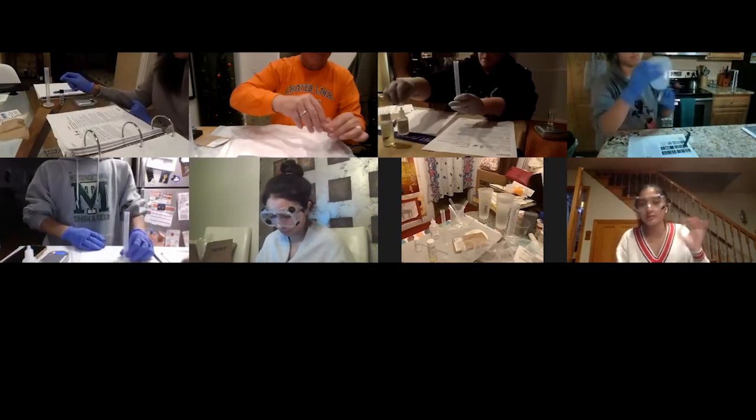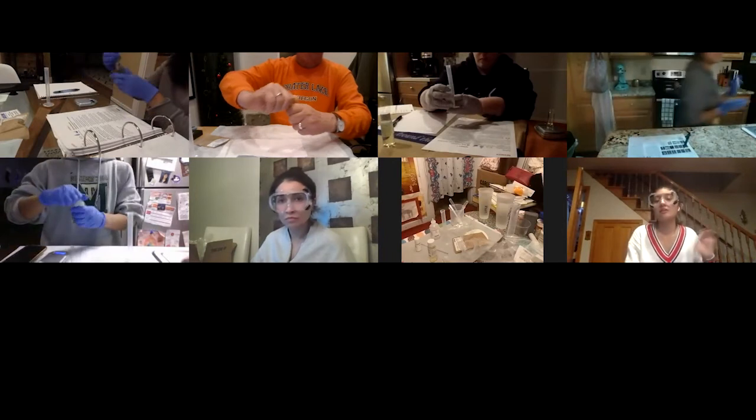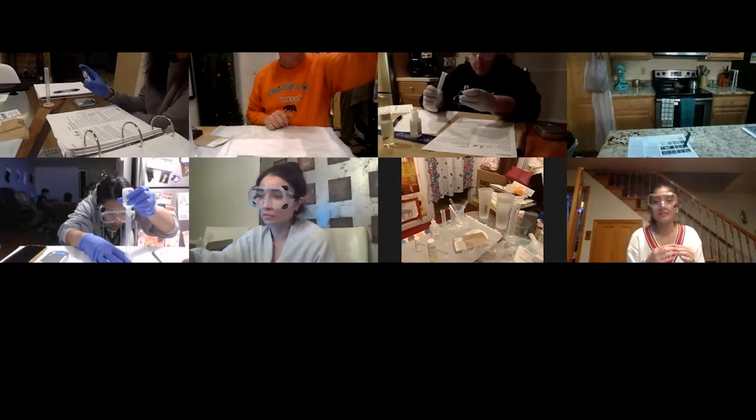Oh dear. Shouldn't inhale the sodium hydroxide. Then you want to cap this quite tightly. You do not want this coming back on us. It said you need to shake it for 5 to 10 minutes.